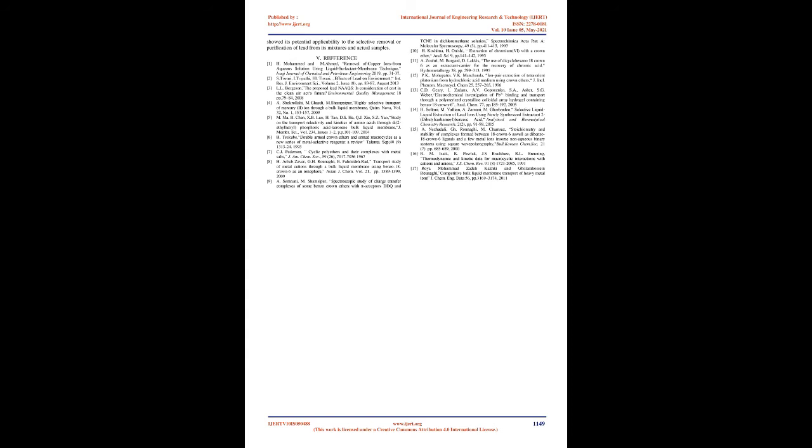After 3 hours of mixing at 300 rpm, the aqueous phase was analyzed with pH and extraction efficiency was calculated. After extraction and separation from feed solution, the organic solvent layer was mixed with 11 ml of stripping aqueous solution at pH equals 5, containing disodium EDTA, 1×10⁻³ mol/L, and Triton X100, 1.4×10⁻³ mol/L, and back extraction efficiency was evaluated.